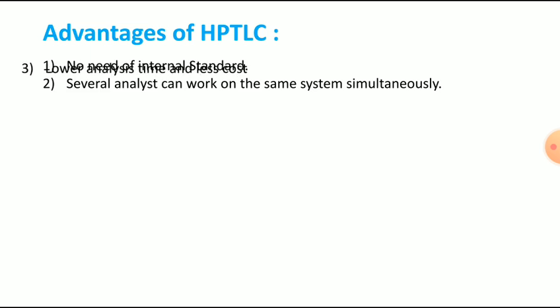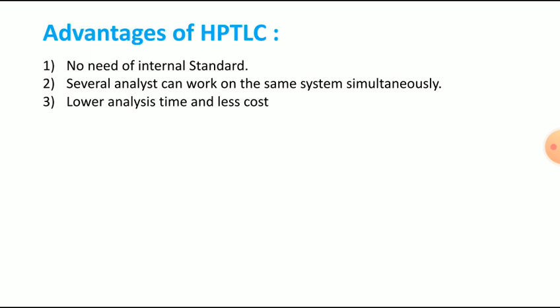Third one, lower analysis time and less cost. That means the time required for the analysis will be very short, and the cost of that analysis will be very less. Fourth advantage, sample preparation is very simple, because we are just checking the solubility or miscibility in the solvent, and in that particular solvent we are dissolving the sample. That will be a very easy task.